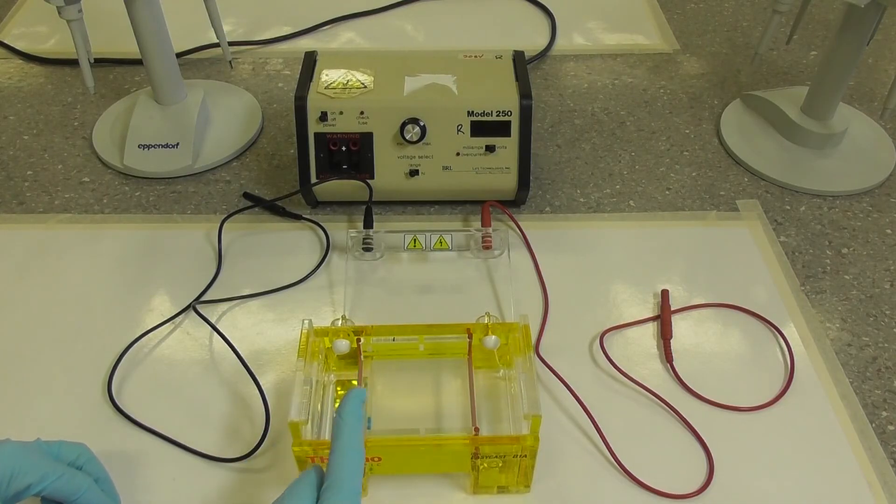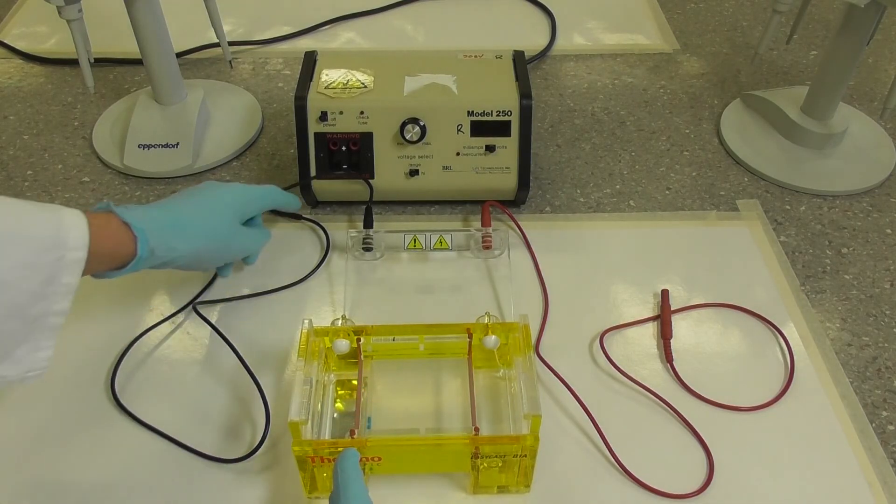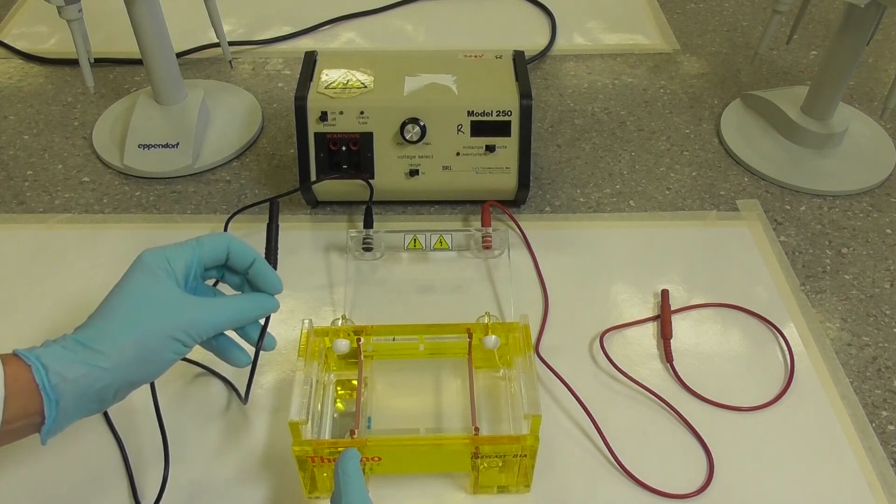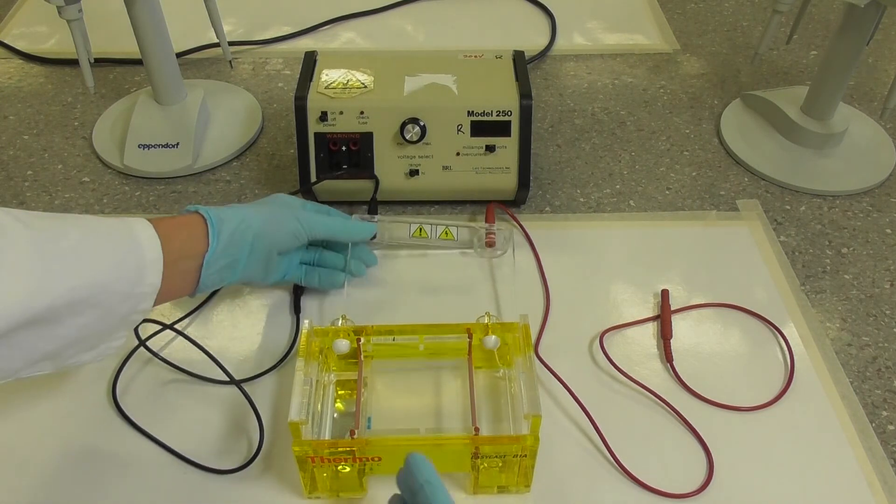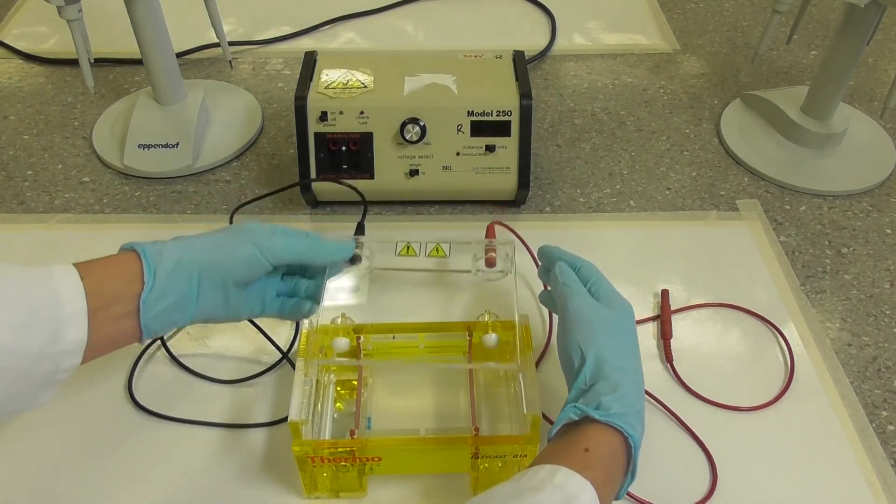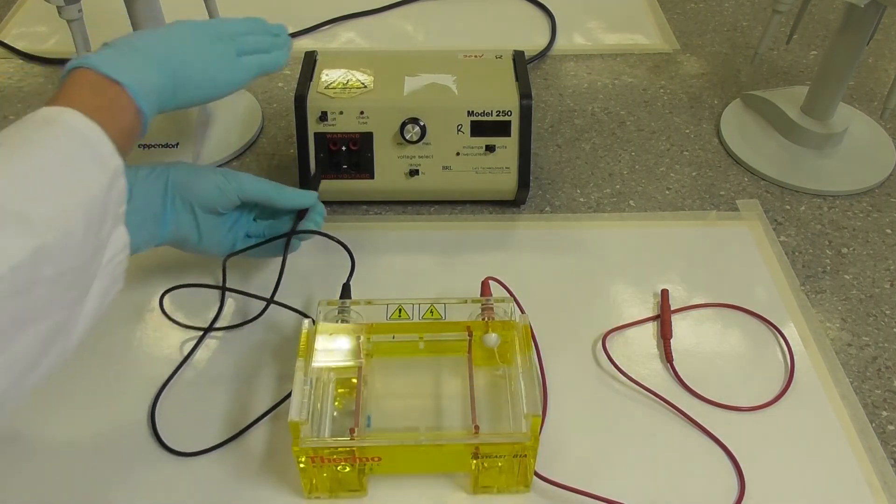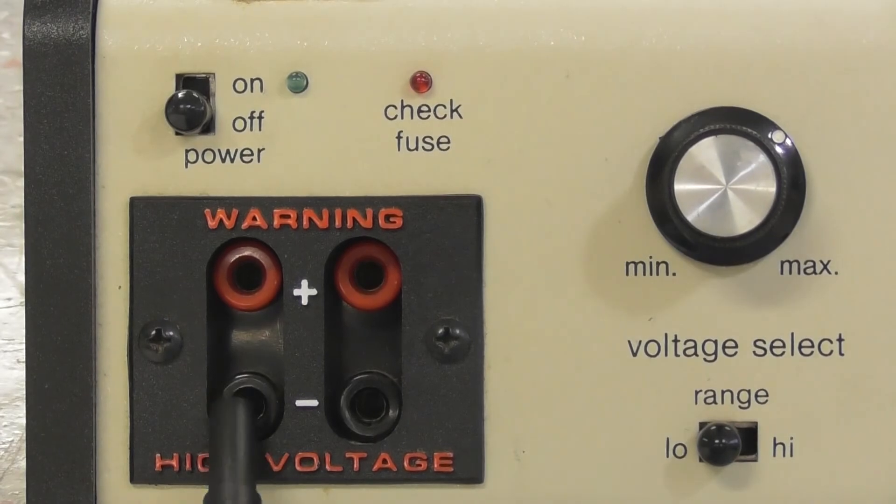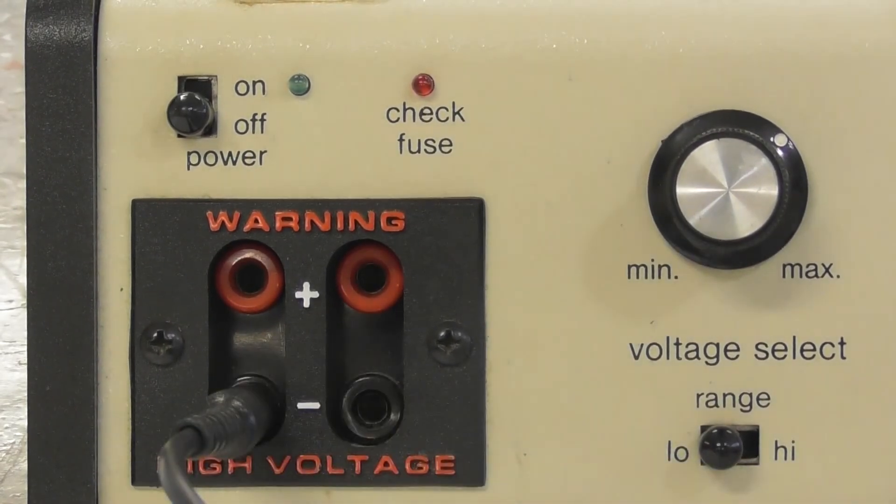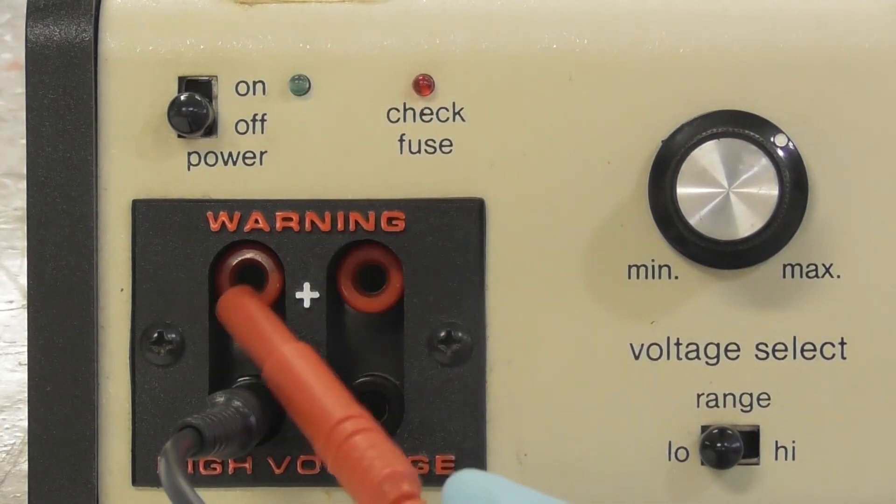Samples will migrate from the negative electrode, which is colored black. Before connecting the power pack, ensure the samples are loaded next to the black electrode. Slide the lid over the electrodes and connect the leads to the power source and turn it on. Ensure the black lead and the red lead are color matched before switching on.